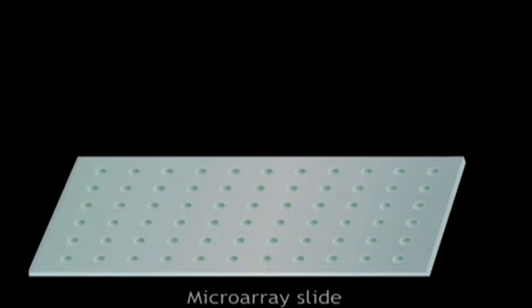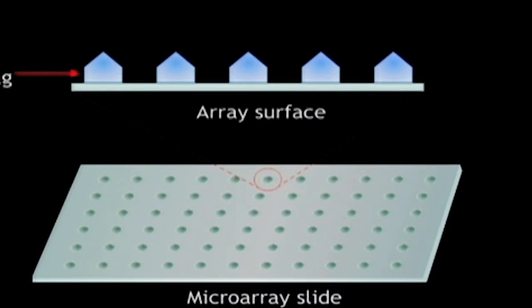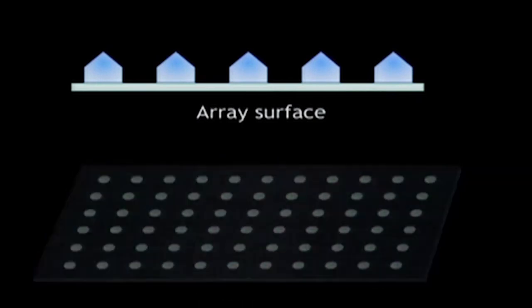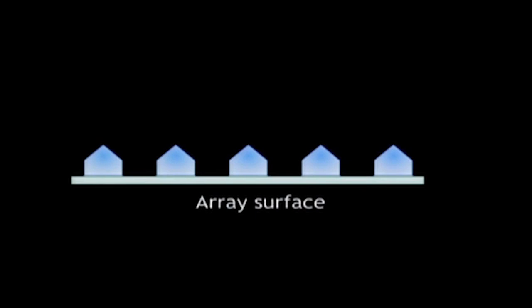Let us discuss the working principle of Halotag arrays in this animation. Halotag technique. In Halotag technique, the slide is activated with the Halotag ligand, which captures the expressed protein through firm covalent interaction, which prevents any material loss and ensures oriented capture of the protein.